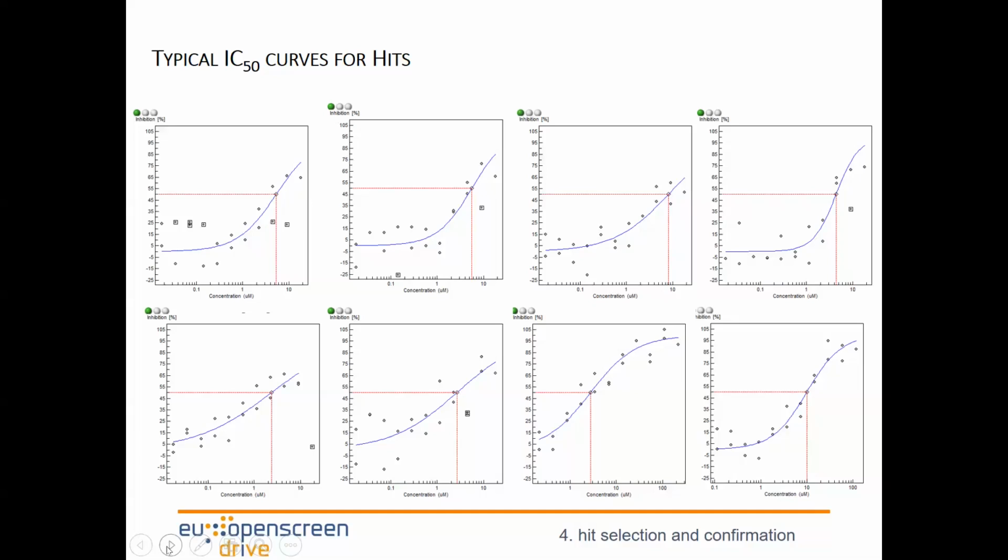All this is possible. You can do some of these activities in Excel or GraphPad Prism, but when you are dealing with high throughput screening on an industrial scale where you have 500 or 1,000 or 2,000 dose response curves, fitting them manually is too time consuming. So next slide.